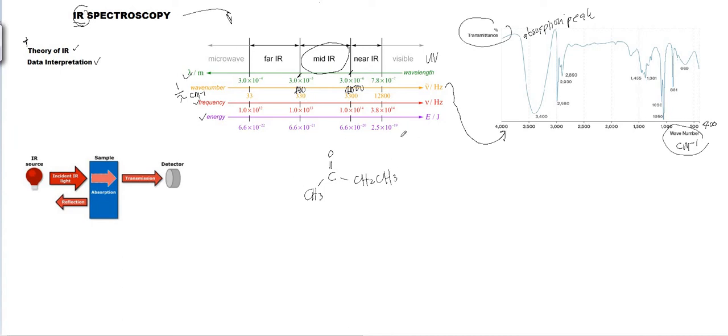So this molecule, okay, kalau kita tengok kat sini, they have many functional group. For example, it has a carbonyl, and then it has a CH3, for example, right? And then kita boleh cakap juga it has many bonding, covalent bonding. Okay, C with the O, okay, C with the H, for example.